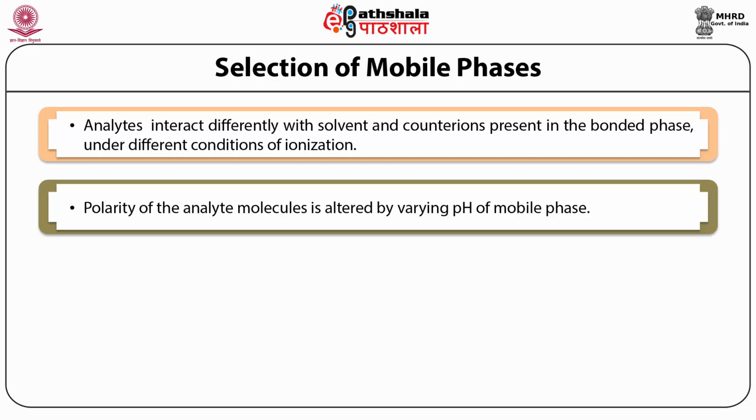Vice versa is true for basic analytes. The relative retention times of analytes can also be altered by changing the eluent pH to achieve efficient separation.